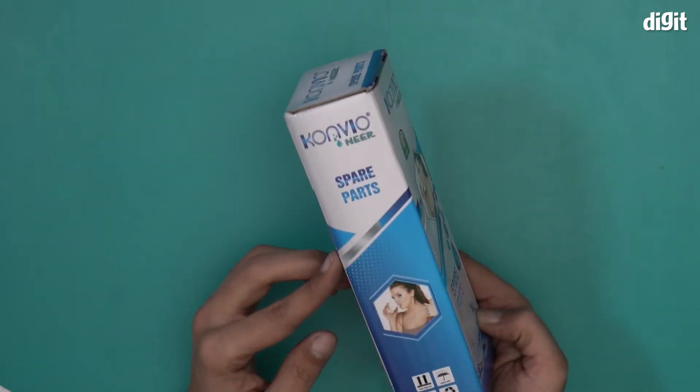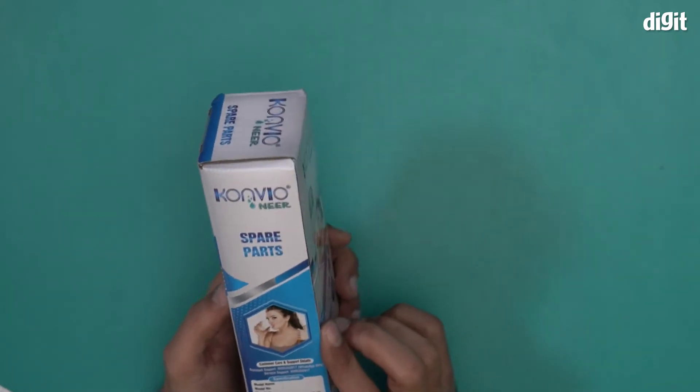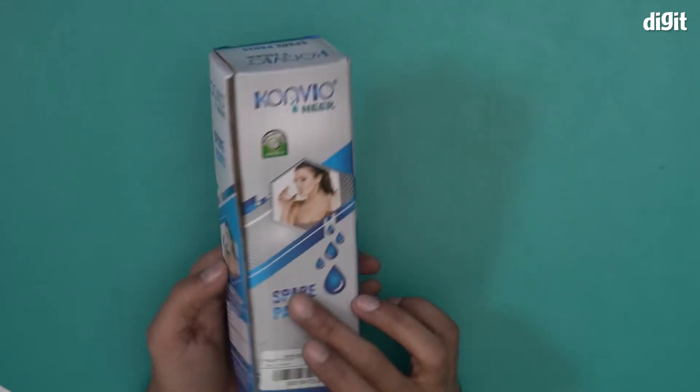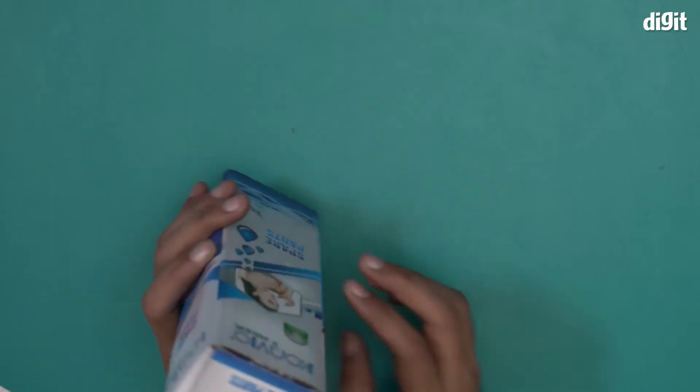So let's open this. Let's quickly see what information we have. To be very fair there's not much information here outside customer care, support and details. So I'll open this and show you what's inside.